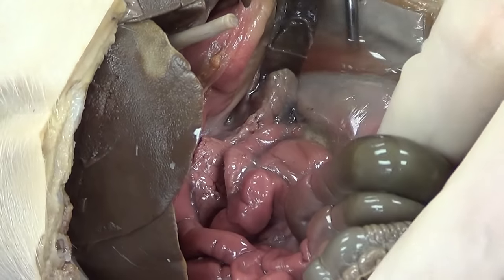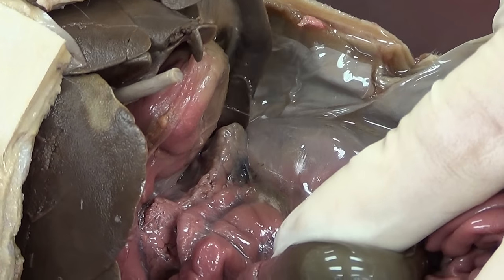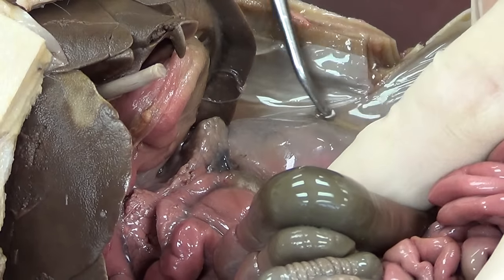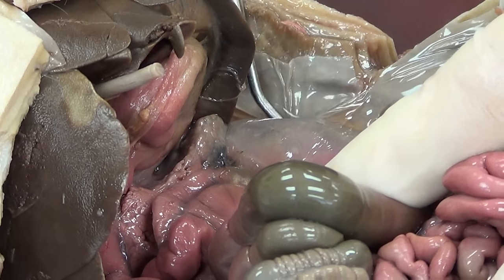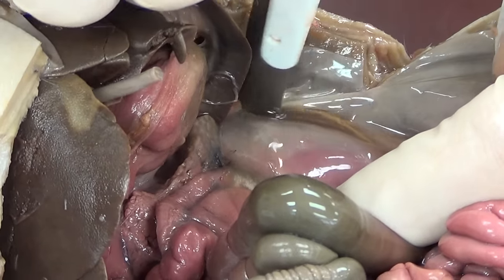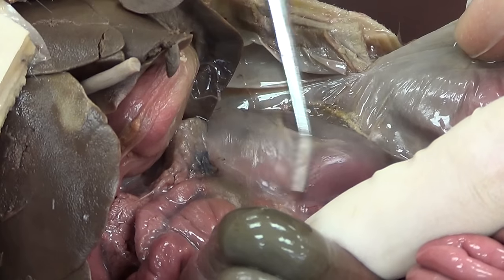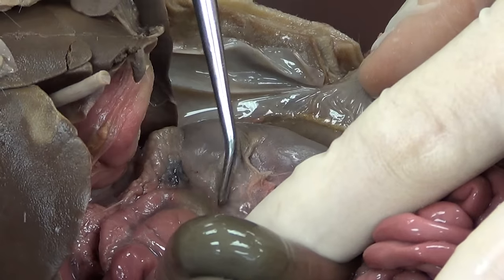Now we can see two more structures come into view. Here is one of those structures — this is the kidney. You can see that it's actually behind this saran wrap-like material, which is peritoneum. This kidney is literally behind the peritoneum. When something is behind the peritoneum, we're going to call it retroperitoneal. I'm going to make a small cut through that peritoneum, being careful not to cut the kidney, then pull off some of that peritoneum and free up the kidney.